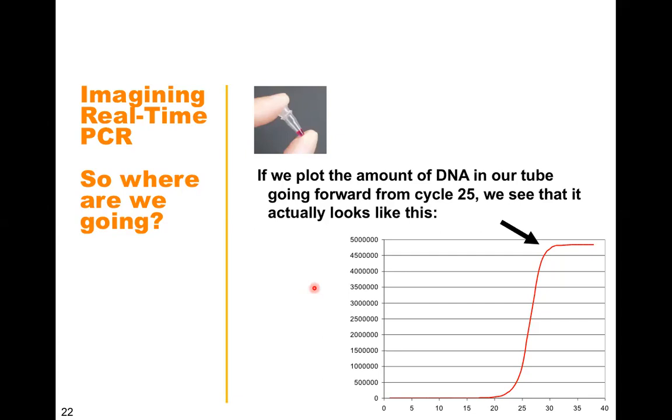So that is about the standard real-time PCR. Now, one may ask whether it is a straightforward calculation where we can directly say, based on the cycle number, that the expression is more or less. Well, the answer is no, because it might happen that you are putting more DNA in case of the cancer sample, and you might get more expression. So we take a standard control, also known as a housekeeping gene or internal control, and we check the expression of that.